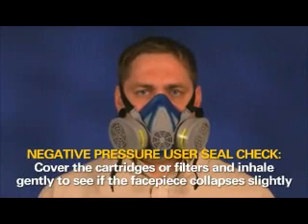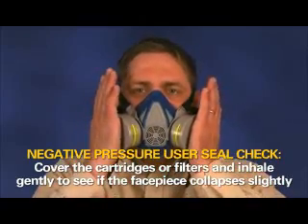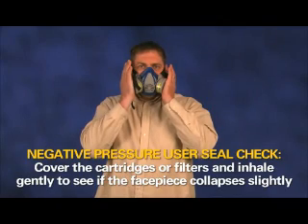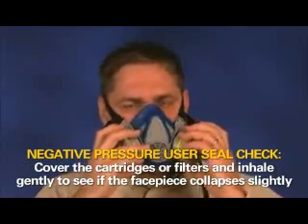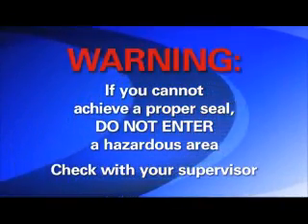Next, perform the negative pressure seal check. Cover the respirator cartridges or filters with the palms of your hands. Inhale gently. If you feel the facepiece collapse slightly and pull closer to your face with no leaks between the face and facepiece, a proper seal has been made. If you detect face seal air leakage, reposition the respirator on your face and readjust the straps, then recheck. If you cannot achieve a proper seal, you are not protected and should not enter a hazardous area. See your supervisor to determine what the problem may be.